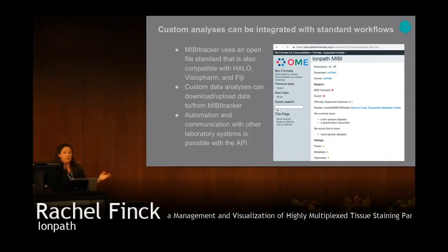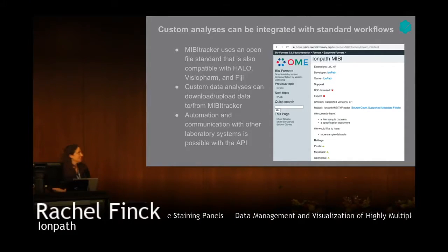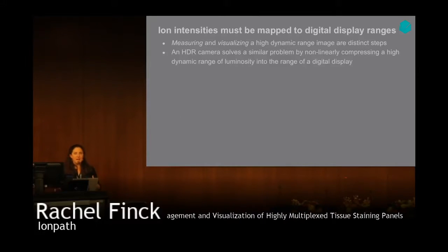Let's switch gears a little bit and talk about some visualization, because as much as we love all of the data management stuff for this tool, a big part of it is having this information jointly with being able to see the images themselves. And I think one thing that can get swept under the rug a little bit is that for some of these mass spec or other imaging technologies that aren't just taking a picture of something illuminated, like a slide under a microscope, there's not necessarily a single canonical visualization, even though we consider it imaging.